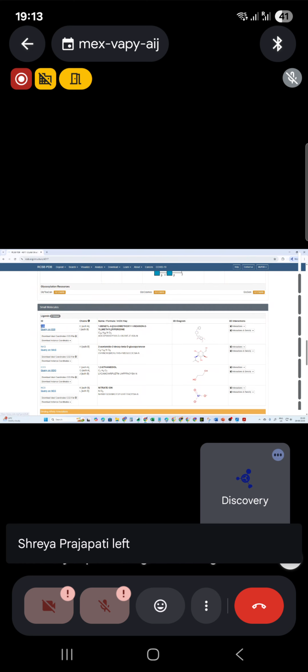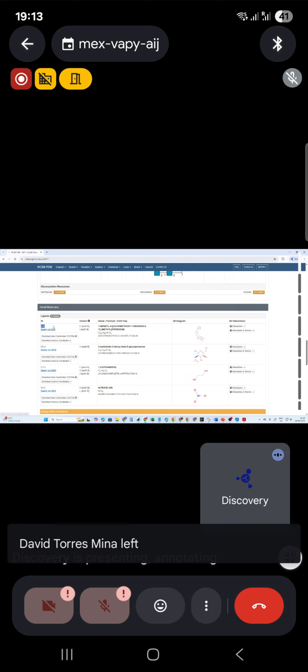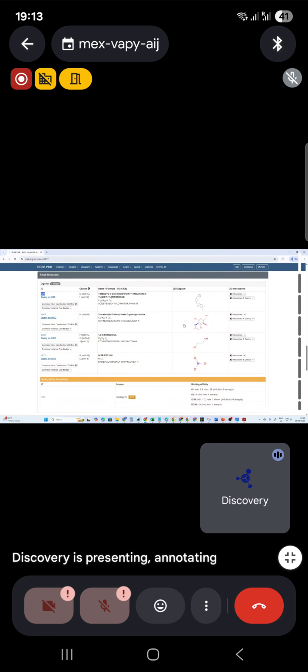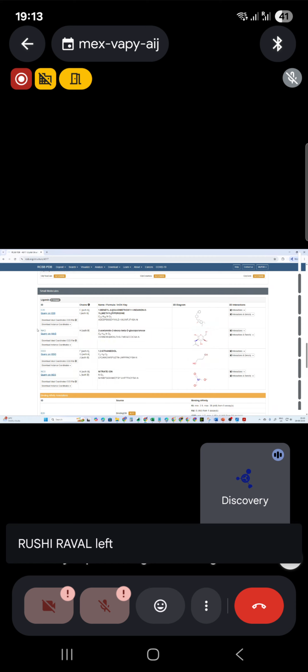We are going to keep the drug molecule. Okay, in the small molecule section we have this drug molecule, and the ID of the drug molecule donepezil is given as E20 in this case. Okay, E20, and then other small molecules are also present, which is again some kind of sugar moiety and some kind of alcohol, and again nitrate ions. Okay, these are again not biologically relevant in this particular case, so I can just simply remove them.